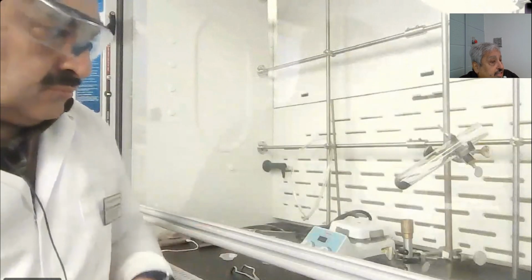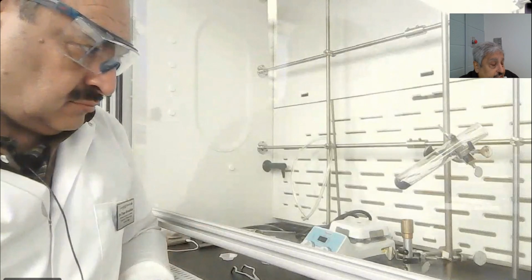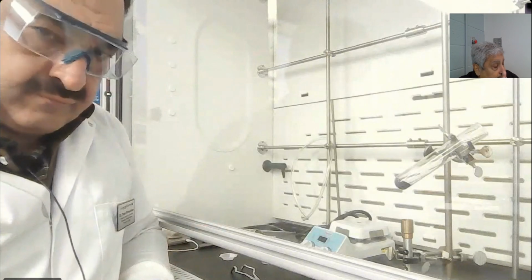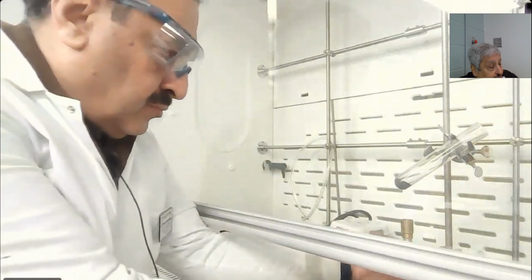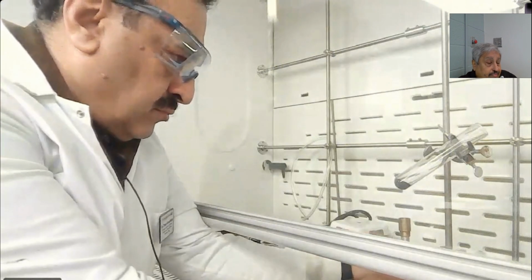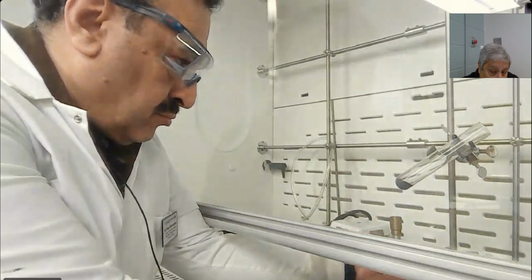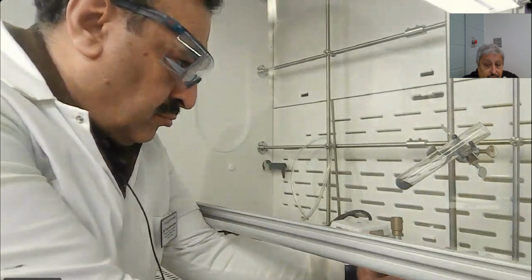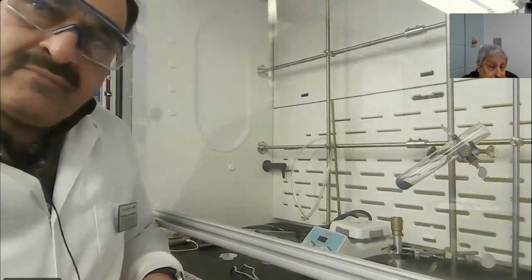First, I will set up the whole distance, everything, for you, and you'll never change this setup. Keep the Bunsen burner in the same place. You just open the clamp to take the test tube in and out. So I will do it for you. The first step, I'll set up the whole thing with the distance between the flame and the test tube.